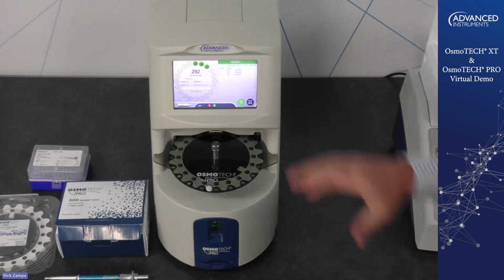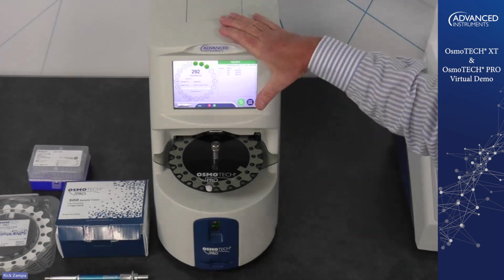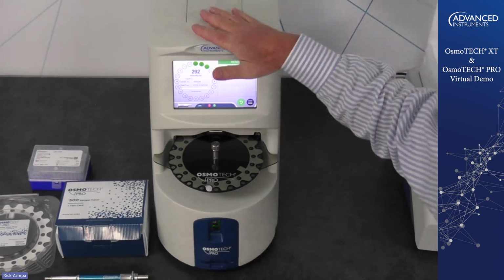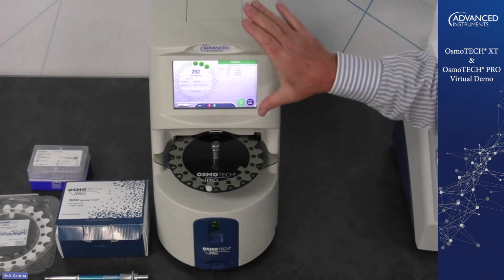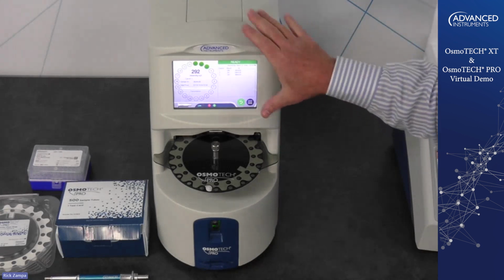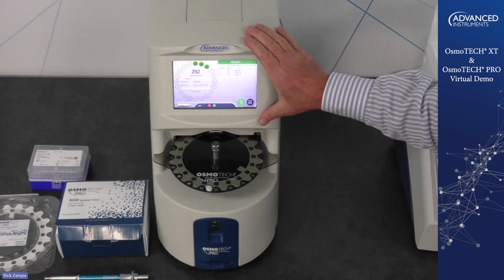Your calibration on this one is at 0, 850, and 2000. Again, calibration only required once a year. It's a 0 to 2000 milliosmol range. So there's only one calibration range on this one, as opposed to the 2 on the XT. This is 30 microliters a sample.